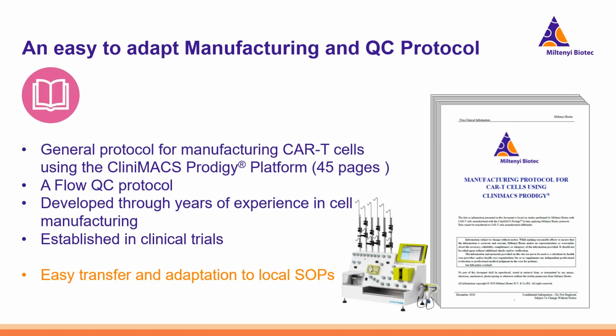The protocol itself is a general protocol for manufacturing CAR T cells using the Miltenyi CliniMACS Prodigy Platform. It has 45 pages and has been developed through years of experience in our own cell manufacturing. And it has been established in clinical trials.